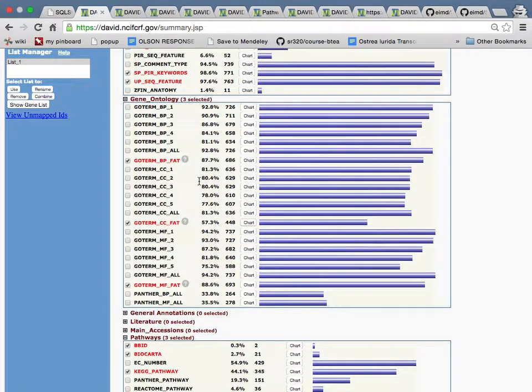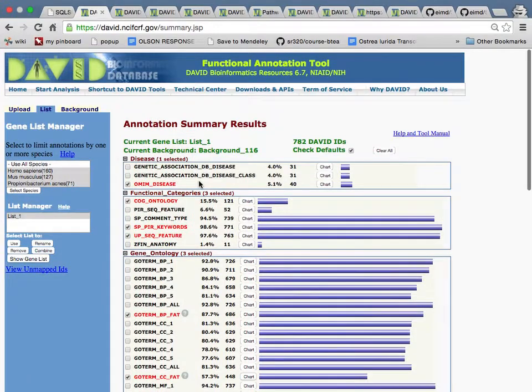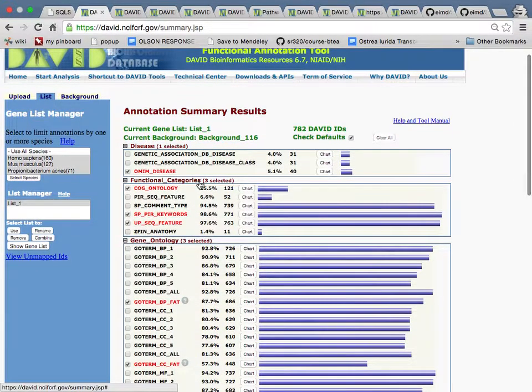This is just based on what I just uploaded. It doesn't stay forever. You lose it off the server in maybe a day, but you can download the files. That's normally what we do: download the files. But I'm just showing you what you can do.